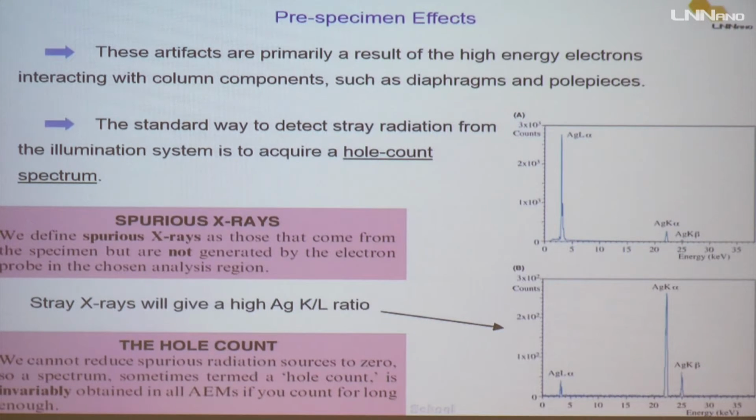Then there are many problems related to the generation of artifacts. You have pre-specimen effects.